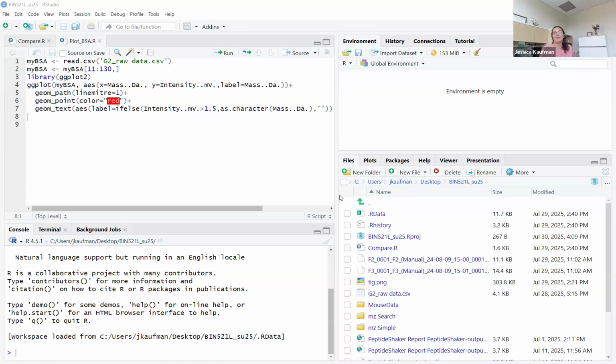So I thought of my examples as not being the key example, right? This isn't where you want your picture to be. They're kind of like the ugly plots that say, okay, this is the basics. This is the information that I want you to have, but think about how with themes and with other settings, you can make something that's a little bit more what you would expect for a publication quality figure.